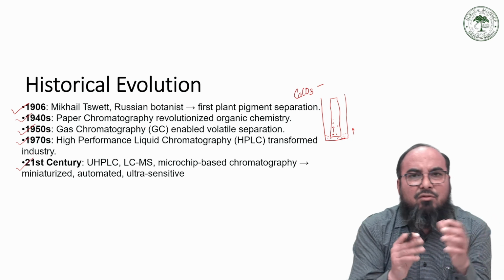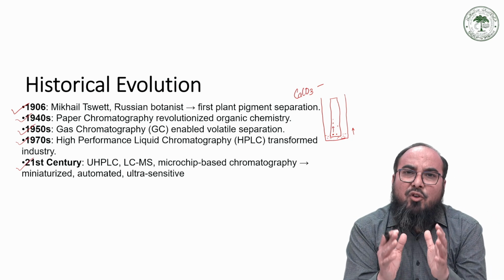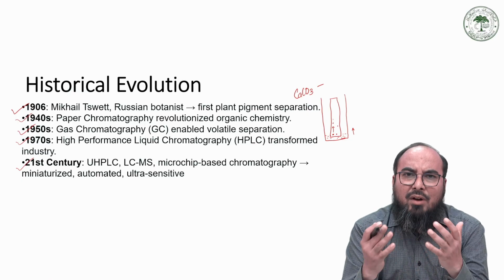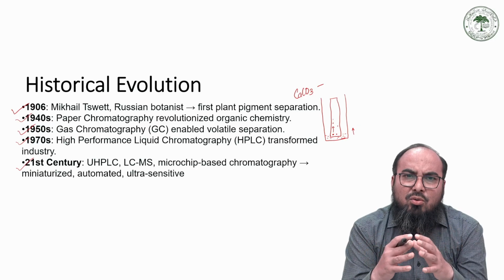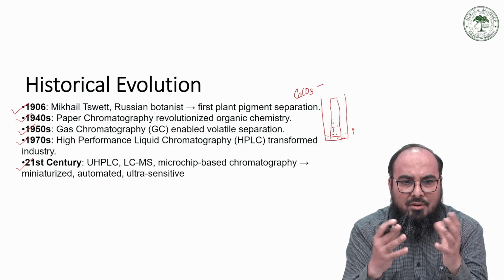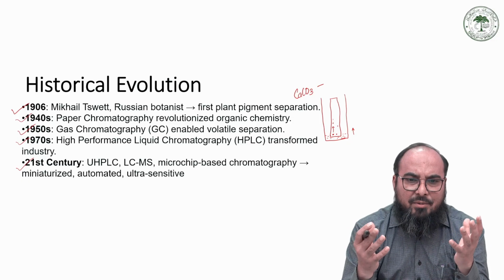Then comes the most advanced technique, called UHPLC, or ultra high performance liquid chromatography. This was more advanced than HPLC, and now you can separate even femtograms of your compound. Okay, femtograms. This is highly sensitive. This is a highly specific technique of separation.